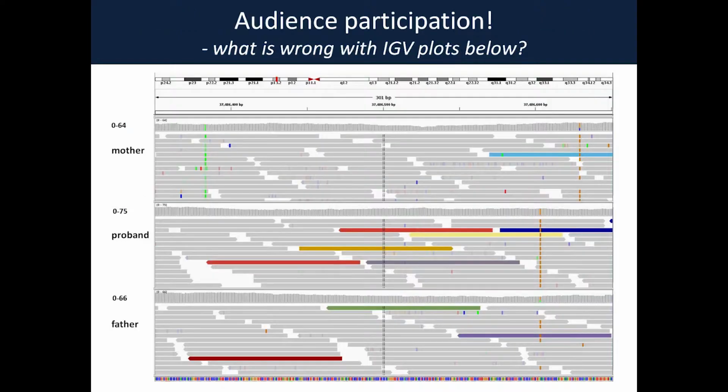So anyway, at this point, this was one of our first whole genome sequencing studies to come off the machine. I started looking at it. I hadn't looked at whole genome sequence data ever before, and I'm not really a bioinformatician. I'm more of a lab-based scientist. So I started eyeballing some of the data just to see what it looked like, picking out a few candidate early onset epilepsy genes, and a few of these happen to be on chromosome 9.